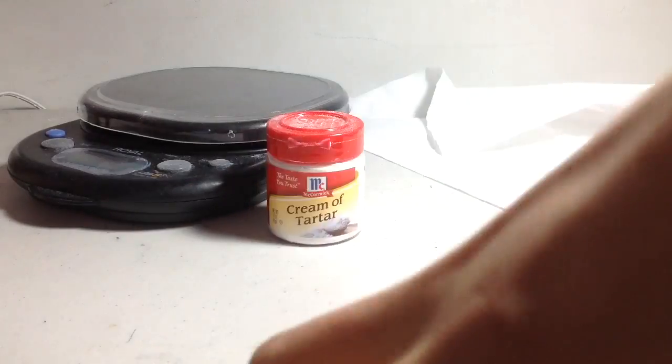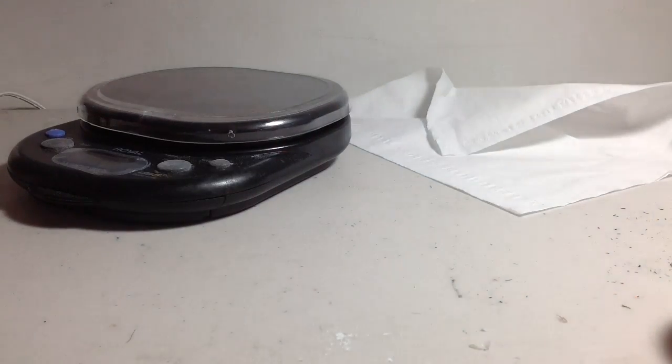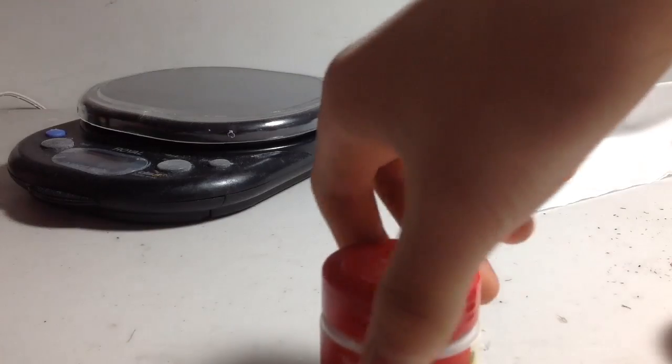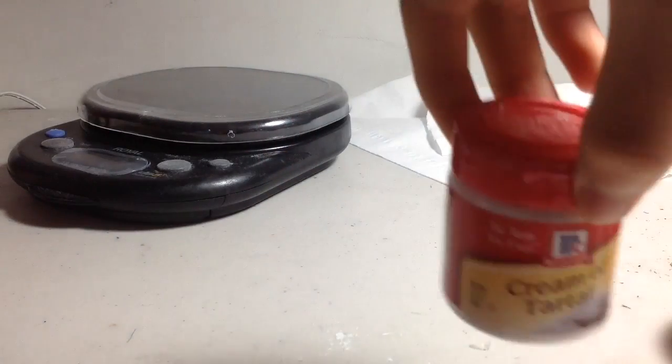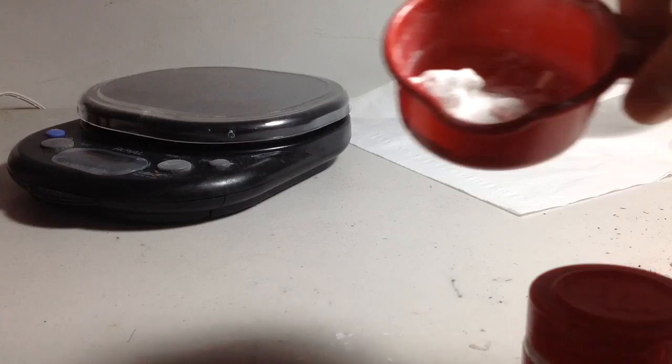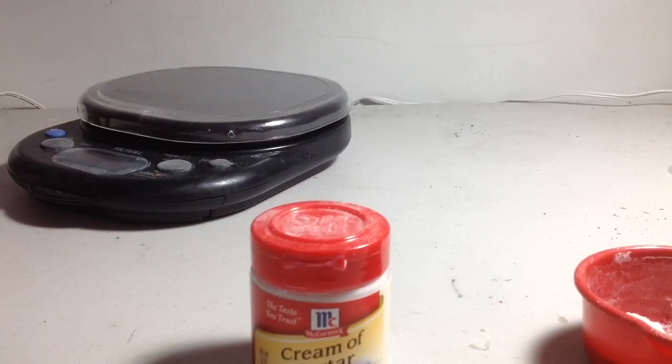First you've got to create the Rochelle salt from these ingredients. We're going to mix cream of tartar, which is potassium bitartrate, with sodium carbonate, which is a base.